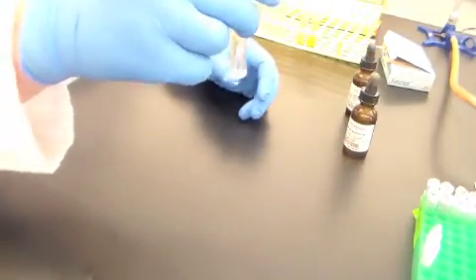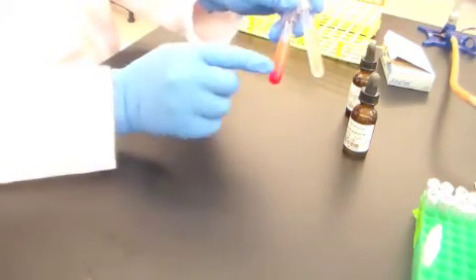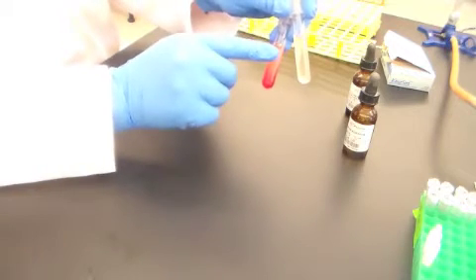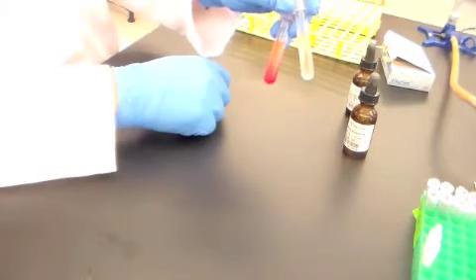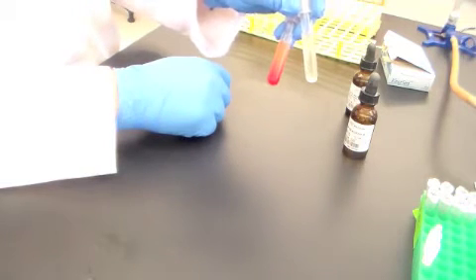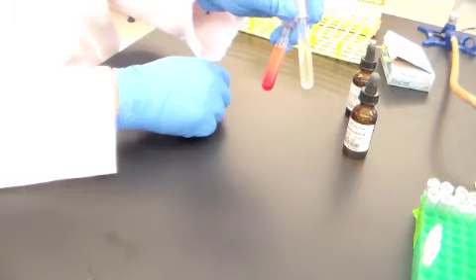Recap that and mix it up. So you can already see, even though it's not quite a fair comparison because I added the reagents earlier to this bacterium than to this uninoculated one, you saw how rapidly the red color developed. So this test for this particular organism on your left would be nitrate reductase positive. This is an organism that can anaerobically respire using nitrate as its terminal electron acceptor.